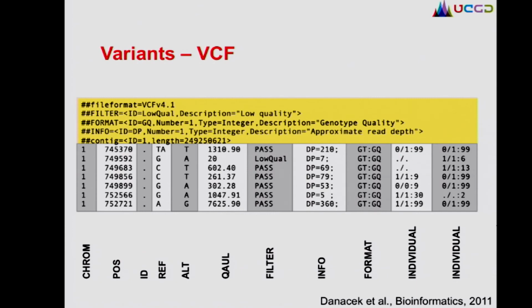And the reason I wanted to just take a moment here is to just remind ourselves that when we call these variants, when we genotype these individuals together, we get information, for example, like this individual is homozygous reference here, but that same individual is missing data at this point. And if this were, for example, one or more of our background individuals, and this was our affected individual, knowing that we're missing data here is extremely important to being able to prioritize the sites that are truly associated with the phenotype.